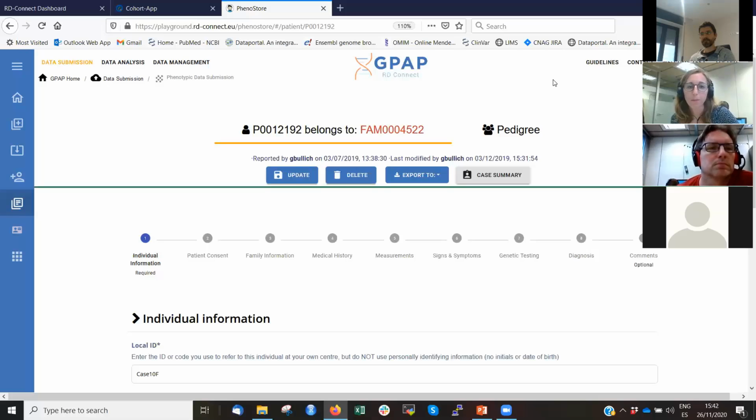Okay, thanks. And another question would be, do we always have to enable other users to see our phenotypic information of the patients that we shared? Or will there also be, for example, in a Genturis sharing policy, a way that we can see the patients of the others without always asking them to share it with us?